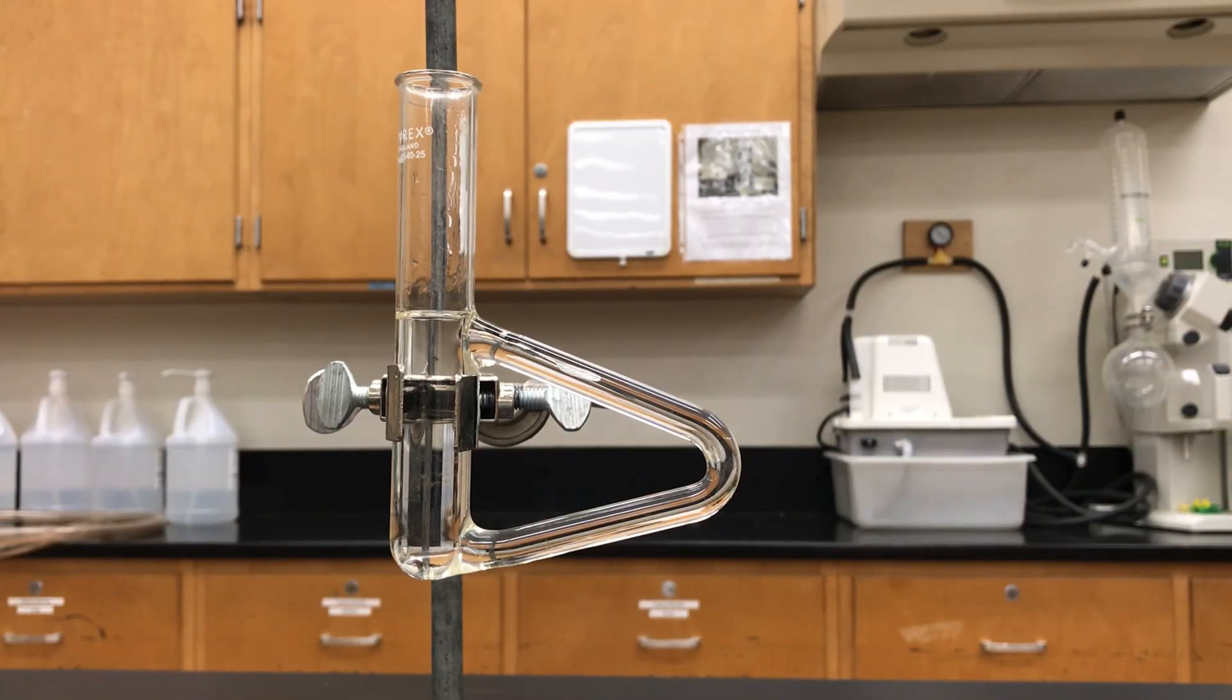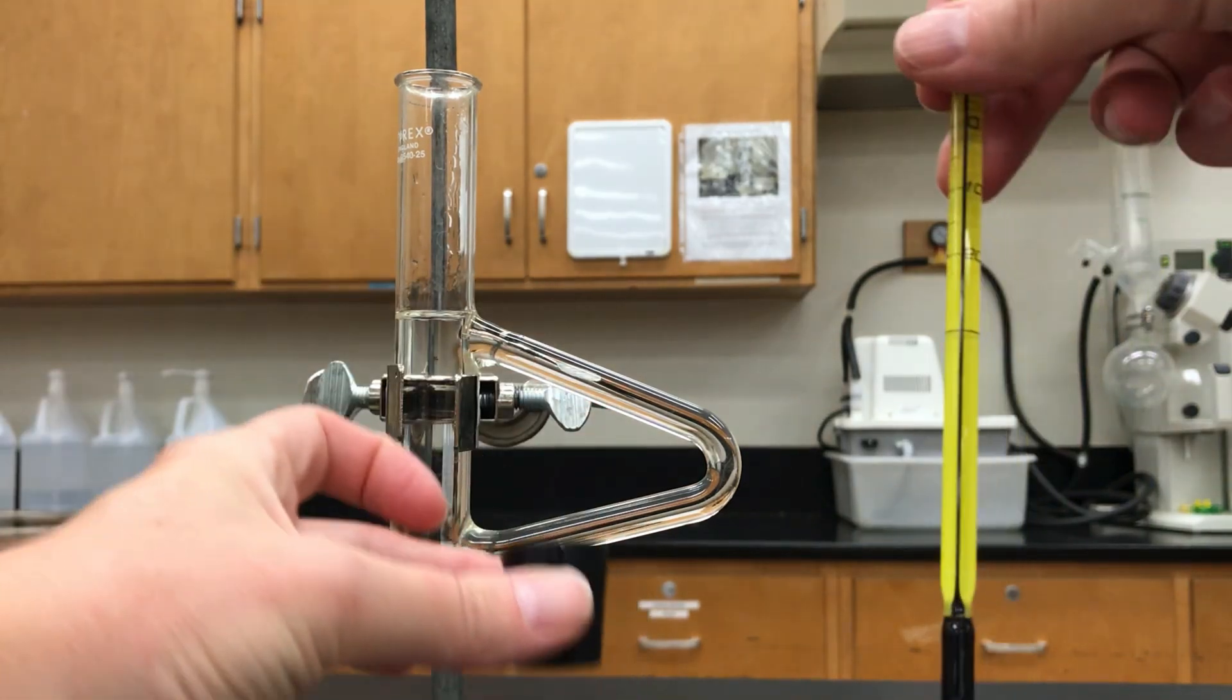First you'll want to clamp the Thiele tube to a ring stand and I tend to clamp it right at the triangle. You also want to make sure that there's enough oil in the tube. It should completely cover that triangular area. There should be no gaps.